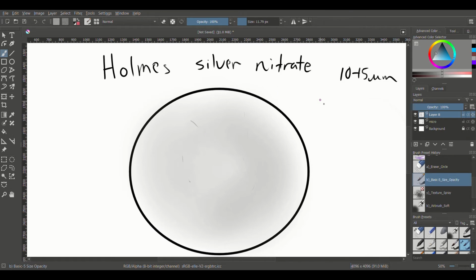Then we're going to tone it with our gold chloride. So you might see a few show up just a bit more darkly, but really, in this one, it says that you're not going to see a ton. It's really not until we get to the next step, which is when we put it into oxalic acid, and that's going to really do the development part.